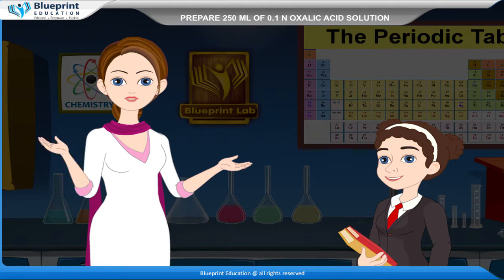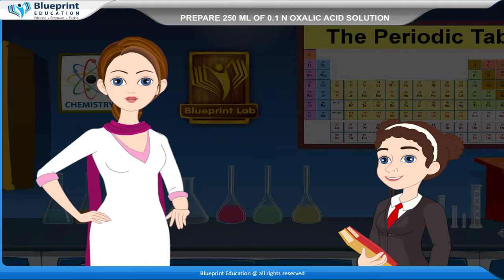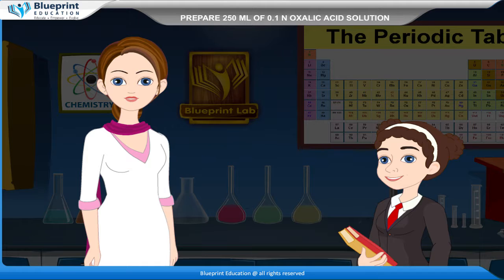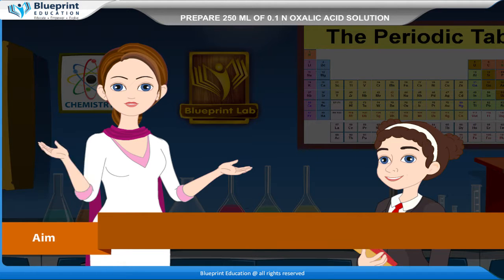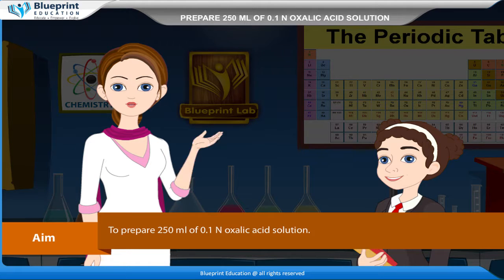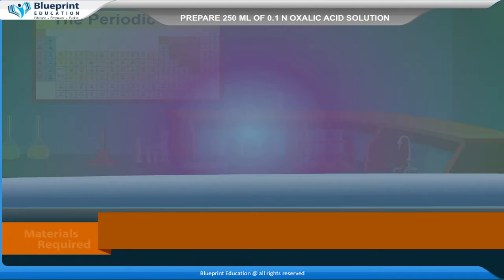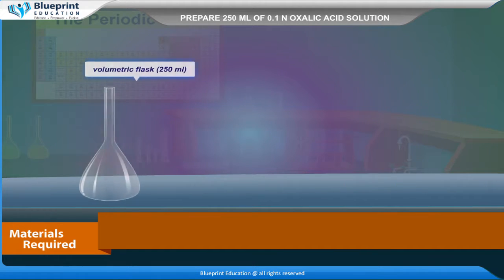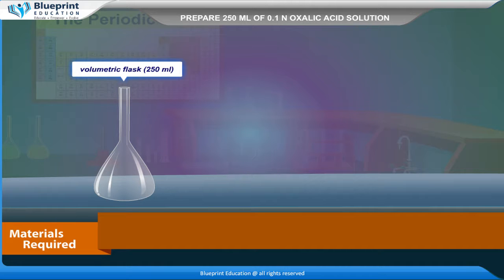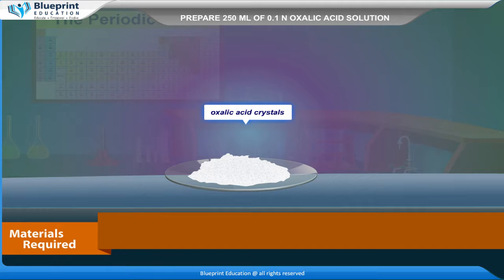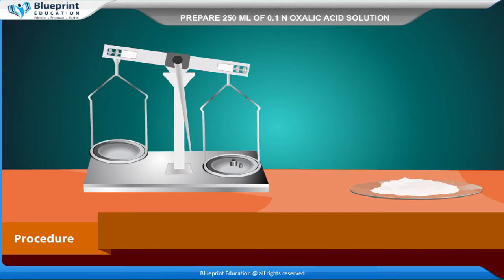Let's do an experiment to prepare 250 ml of 0.1 N oxalic acid solution. The aim is to prepare 250 ml of 0.1 N oxalic acid solution. The materials required are: balance, weighing box, 250 ml volumetric flask, weighing tube, and oxalic acid crystals.